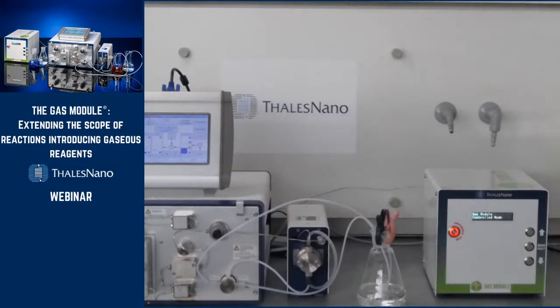There are two modes in this gas module. First, there's a standalone mode in which you can provide a flow rate to any flow setup, I would say. Not especially the H2 Pro, but any other flow setup you would have made.